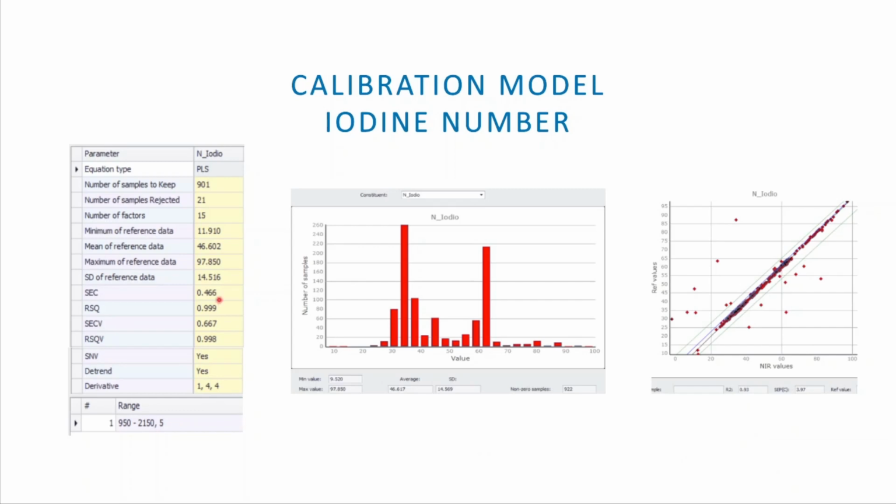A derivative pretreatment is applied to the spectrum. The standard normal variate approach effectively removes the multiplicative interferences of scatter and particle size. Detrending accounts for the variation in baseline shift and curvilinearity. These are typical setups for NIR calibrations.